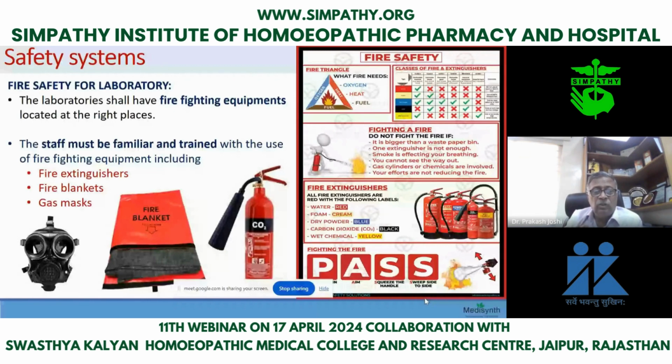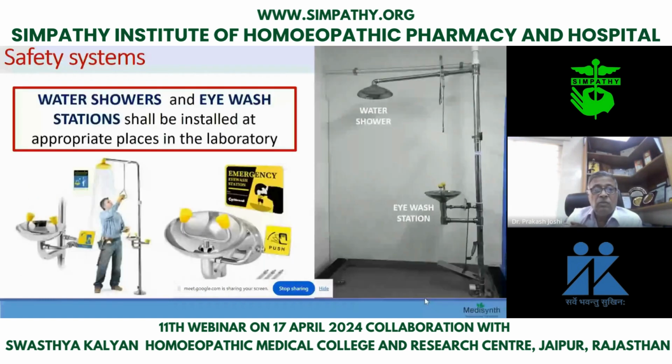So it is never that an accident has never taken place in the laboratory. It always takes place daily. Something or other happens. But it is out of your learning that you try to develop a laboratory with good laboratory practices. Now these are the showers, these are safety systems. Water showers and eye wash stations shall be installed at appropriate places in the laboratory. So maybe small laboratories may not have them, but usually for the big laboratories it is mandatory, if you want to go for GLP, then you should have all these basic facilities.